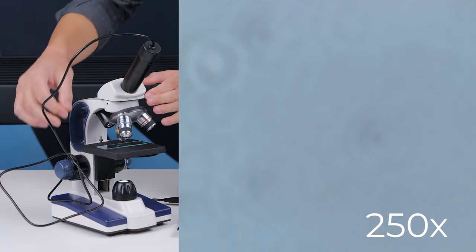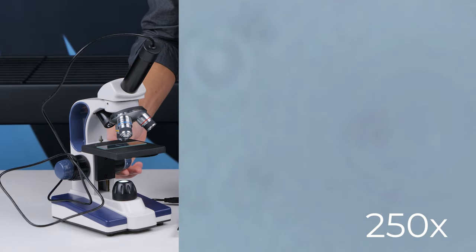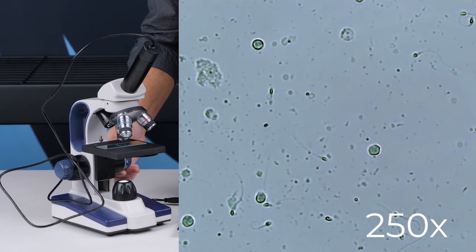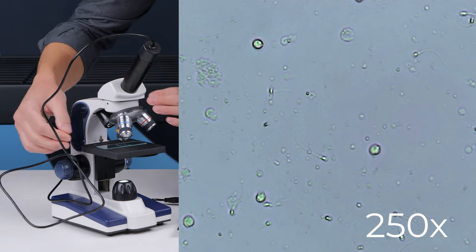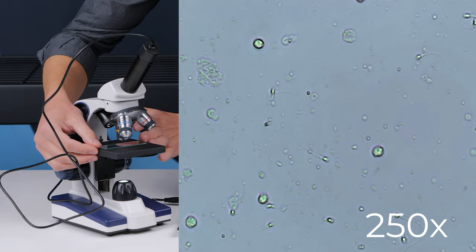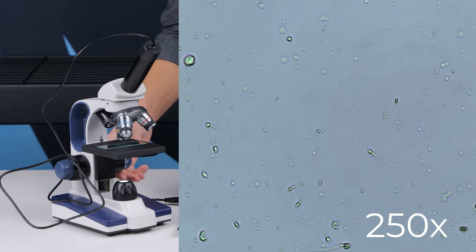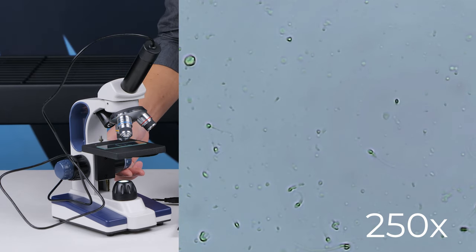This is the 10 times objective now. And this is really going to be kind of the bread and butter when you are looking around for sperm. So you can see there are some little floating particles, but those, of course, aren't the sperm. It looks like we do have some of the sperm in this shot. I mean, really, anywhere I go, you're pretty much going to be seeing sperm.